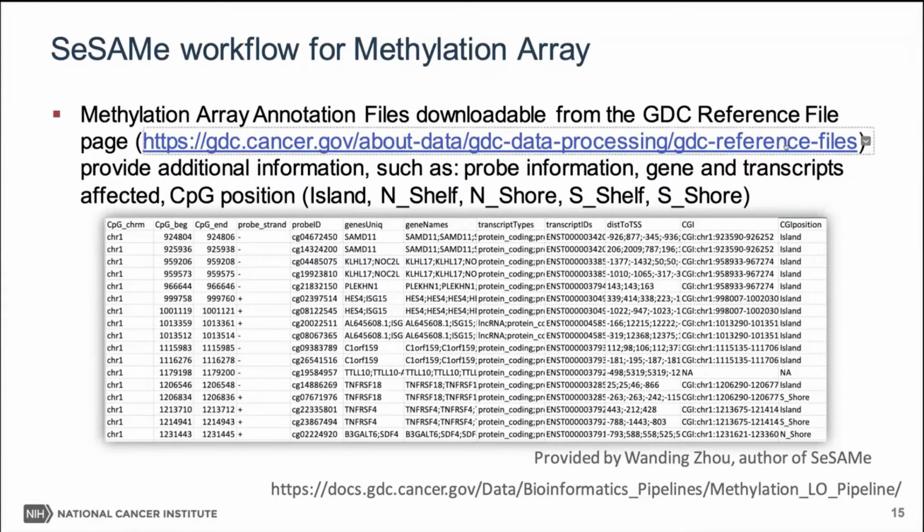We have all the FASTA file, the gene models, the star index file, but also we have things like that. This is the methylation array metadata information.